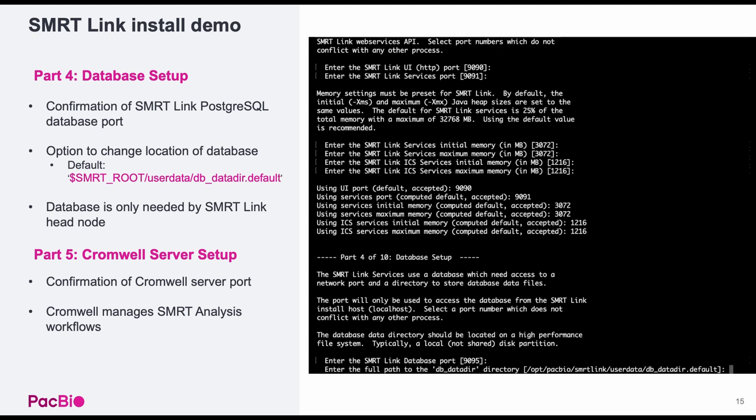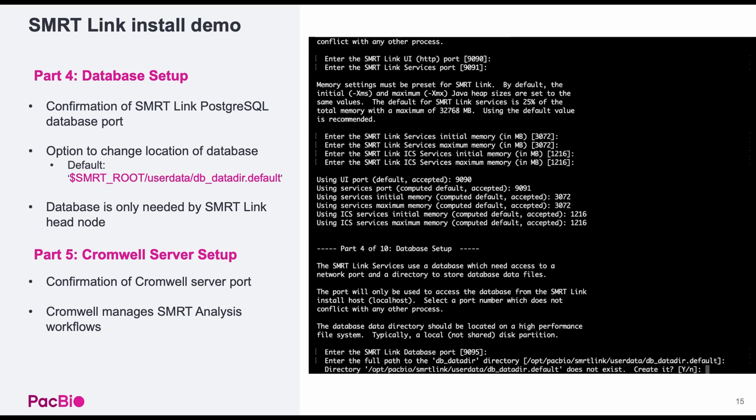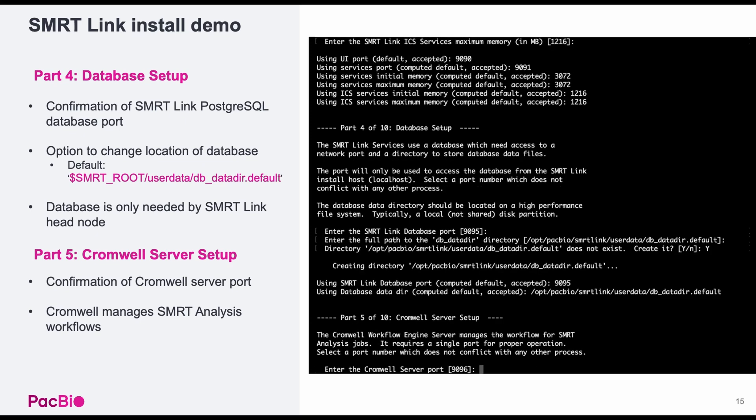Part four is setting up the SmartLink SQL database. In particular, the placement of the database can be altered, but I will be accepting the default location in smartroot userdata dbdatadir.default. Part five is setting up the SmartLink Cromwell server for smart analysis jobs. Again, the default port can be accepted.